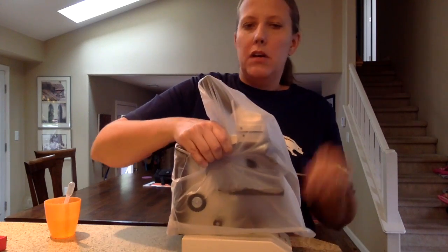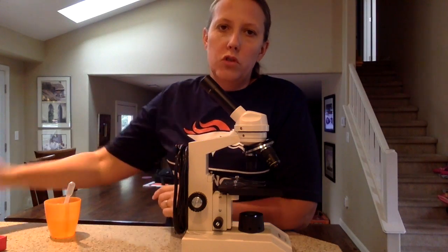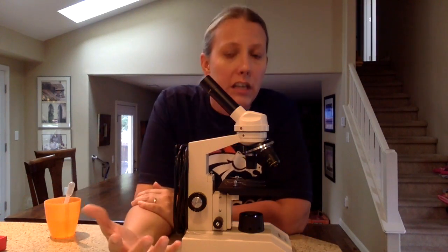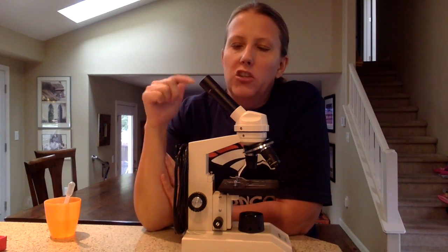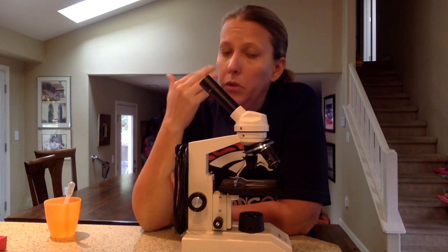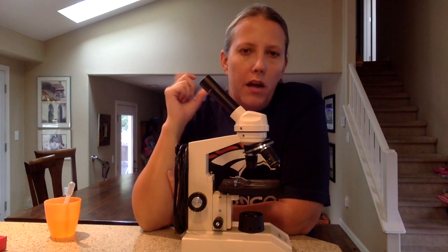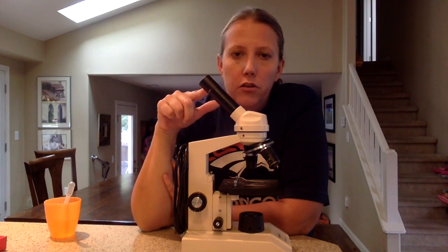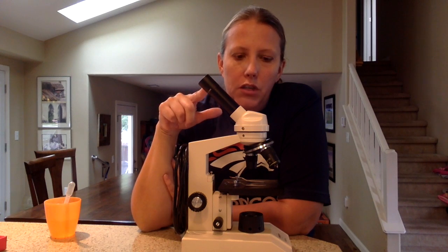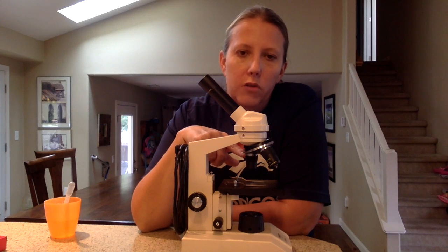One last thing: if you think the lenses are dirty, please let me know. Don't try to clean them yourself, even with Kleenex — because Kleenex, while it seems soft, will actually scratch the lenses. I have very special, very soft paper that we can use to clean either the ocular, which is the one that usually gets dirty, or even the objectives if those get dirty too.